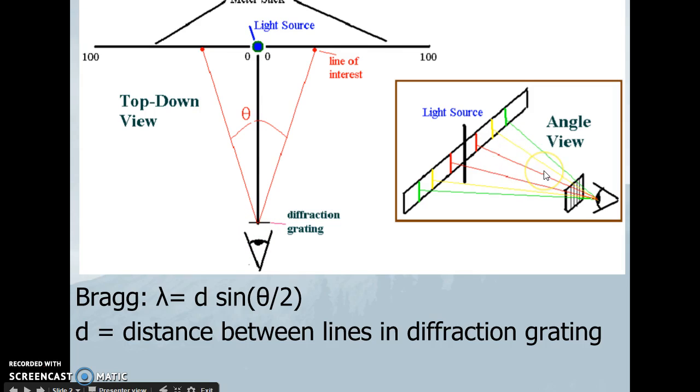So, as you've done in lecture, you've looked through light through a diffraction grating, which is kind of like rainbow glasses. And what it does is it takes your one colored light, so we have our light source sort of in the middle, and we see the individual colors on each side from that light source. So the diffraction grating sort of splits up those lines, and so we can see the individual photon colors. Our goal in this lab is to determine what the wavelengths of these specific colors are.